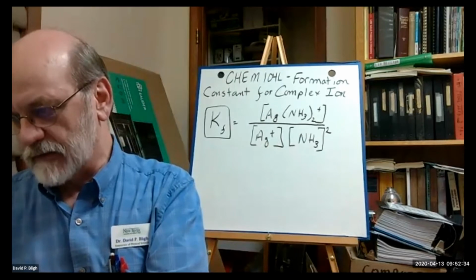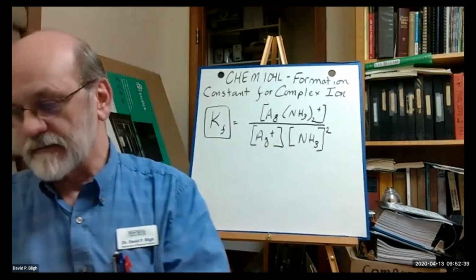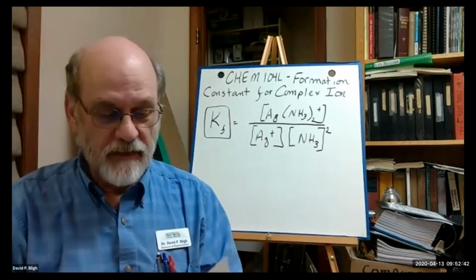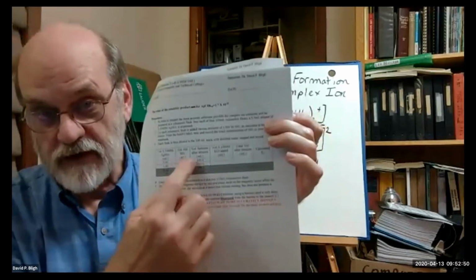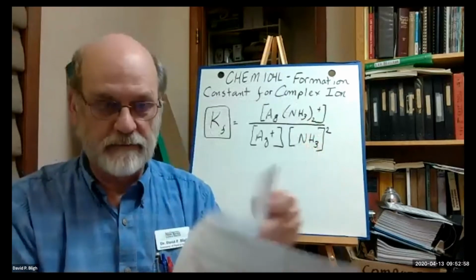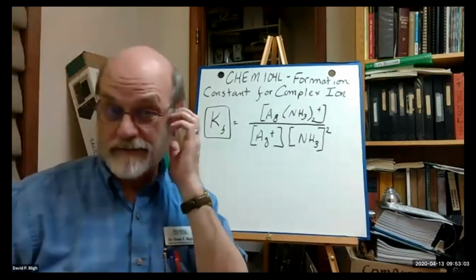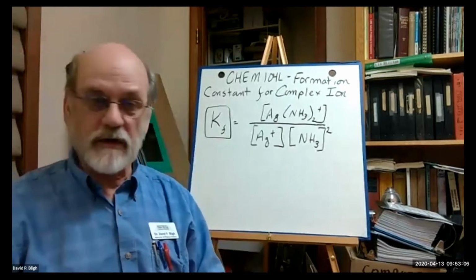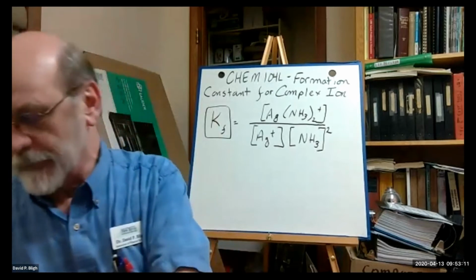What else will we have? You'll notice, just a caveat, the method calls for 2 different titrations. You remember titrations. You better remember titrations. We actually have 2 data sets here that are available. We're only going to use the first one. Just ignore the second one. It's been my experience that the second one never works very well anyway. So we're just going to do the calculations based on 1 titration.